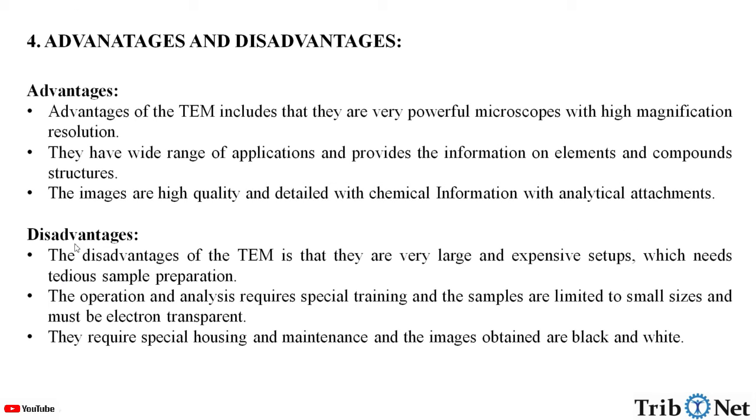What are the disadvantages? The disadvantages of the TEM are that they are very large and expensive setups, which need tedious sample preparation. The operation and analysis require special training, and the samples are limited to small sizes and must be electron transparent. They require special housing and maintenance, and the images obtained are black and white.